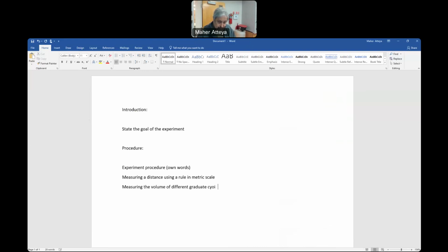Cylinder here. And those are done manually and virtually in the lab. So we did the manual lab procedure as well. So here, virtually on the lab procedure, as well as manually in the actual lab.